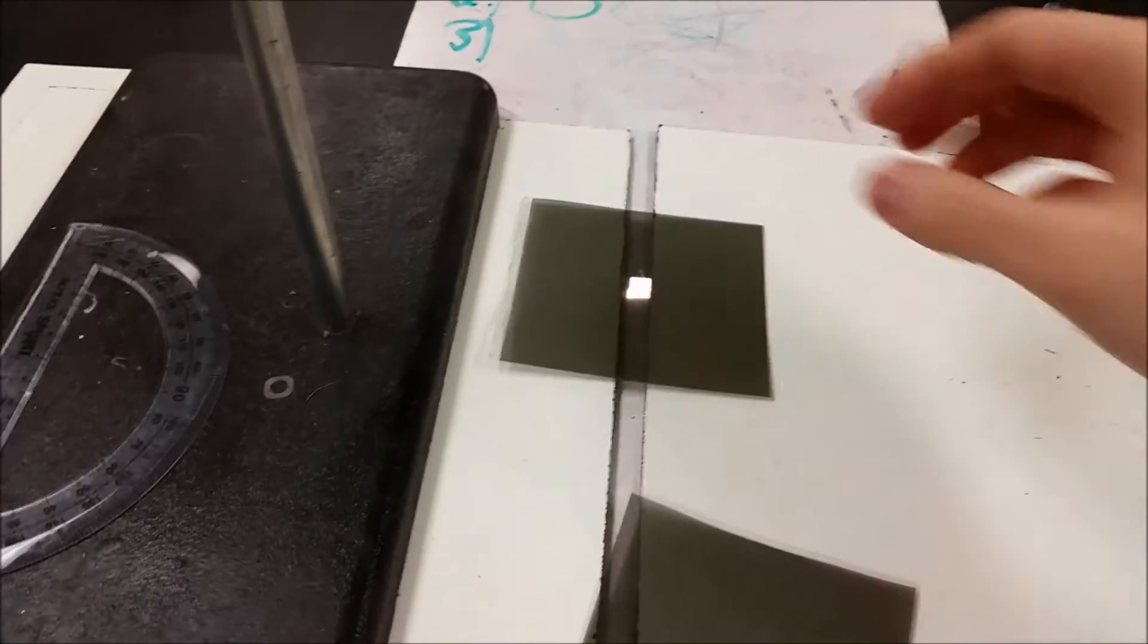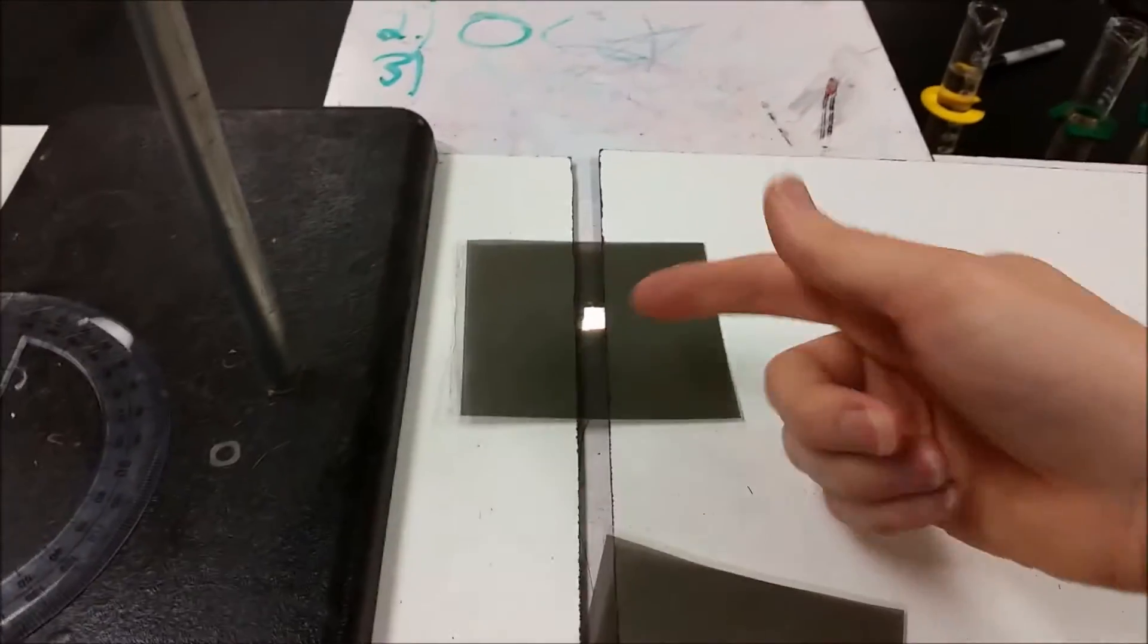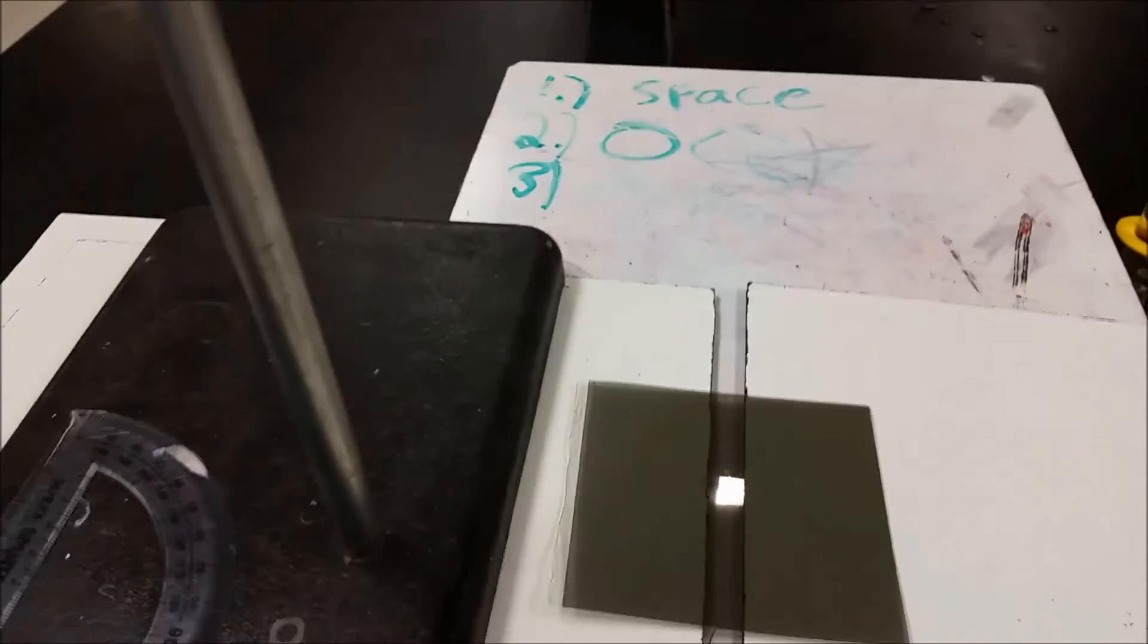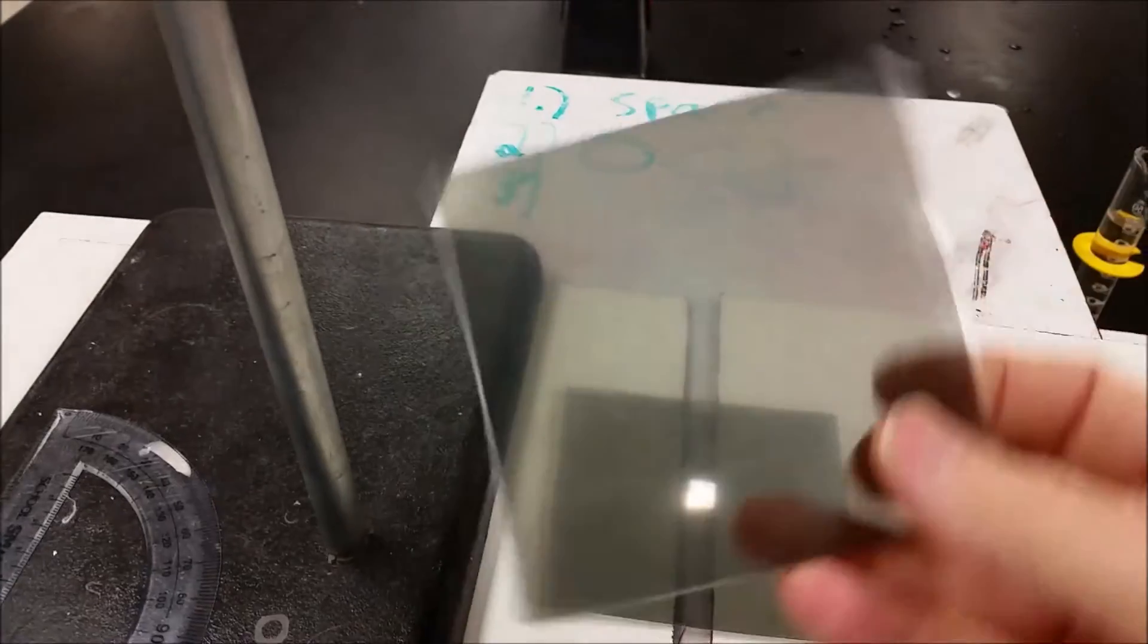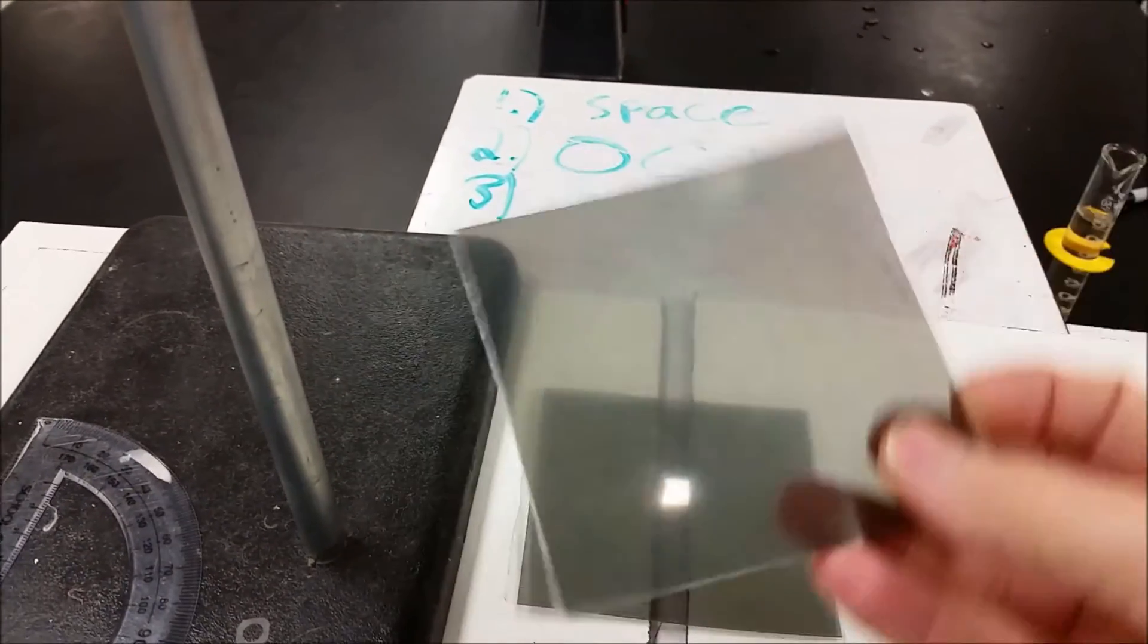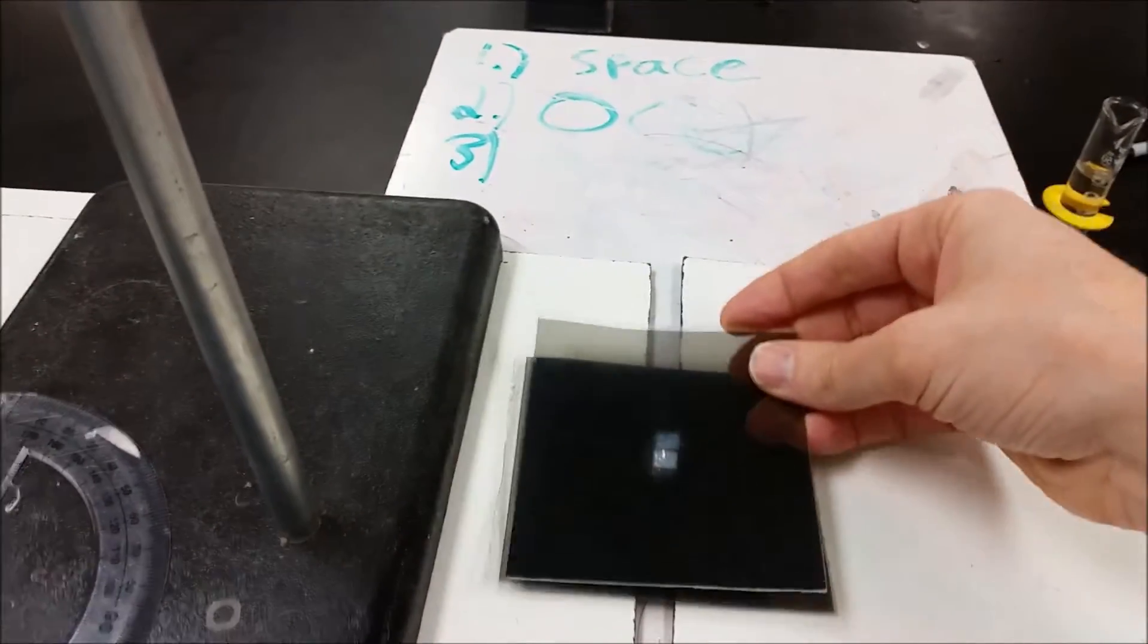Okay, so here's our setup from the side angle, and there's our polarizing filter. You can see the light kind of bouncing off there. Hold it right overhead, and we have our second polarizing filter, which, depending upon the angle, will determine how much light makes it through.